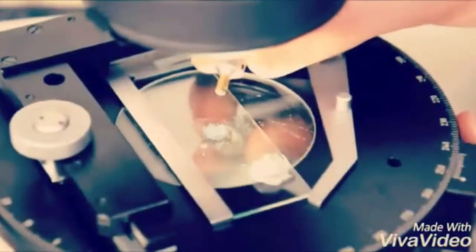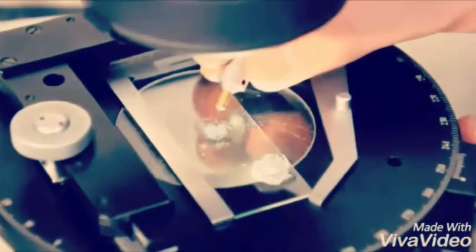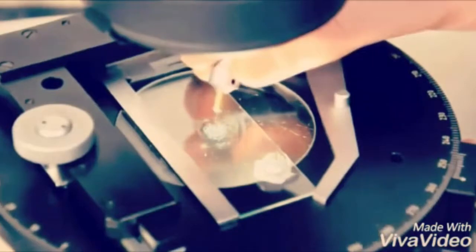Once the crystal is selected, you need to mount it on the tip very carefully, because the crystal is very fragile and easily broken. The crystal needs to be placed on the slide to isolate the crystal more easily.